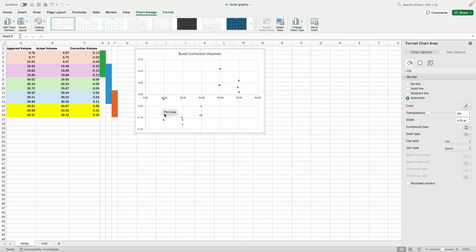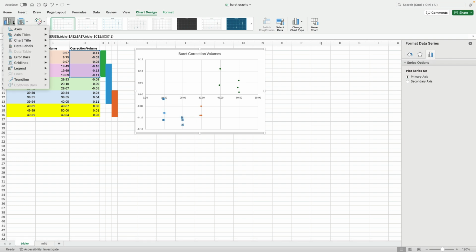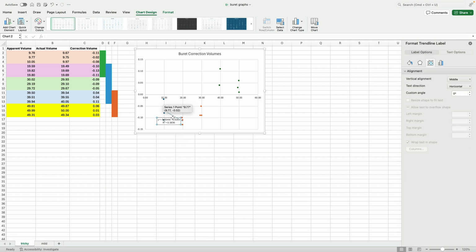So now we're going to go through and we're going to click on the first set, and let's throw in a trend line, and we can go ahead and put the equation in the r squared. You can see that this is not a great r squared, but because this is the smallest chunk we can do, there's not much we can do about that.